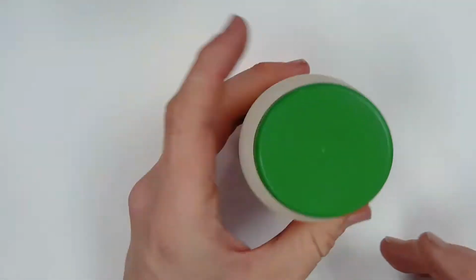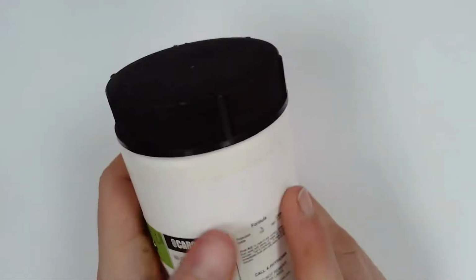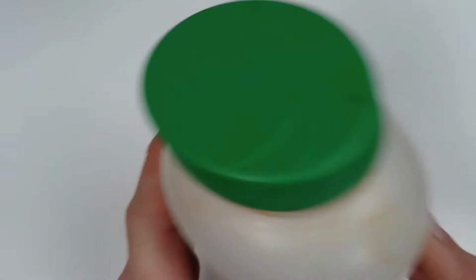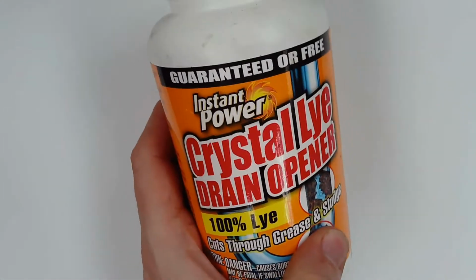Got some lead nitrate. That's familiar to us. Lead nitrate's really heavy for its size. It's lead. Got some potassium iodide. Pretty useful chemical in the lab. Iron 3 nitrate. Again, kind of a little bit rarer chemical. Worth noting, I've got some sodium hydroxide in the form you can buy it in like a hardware store.